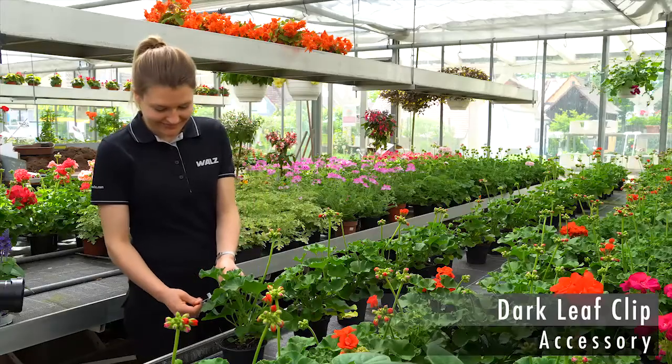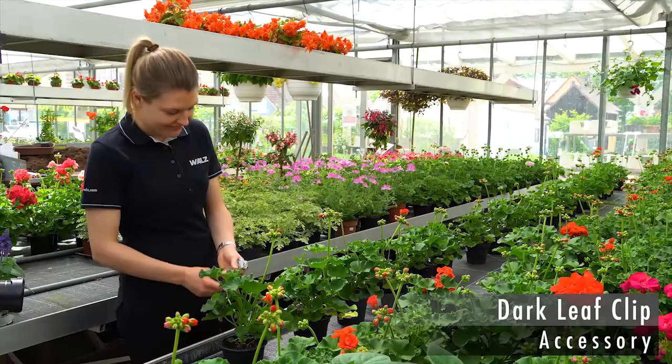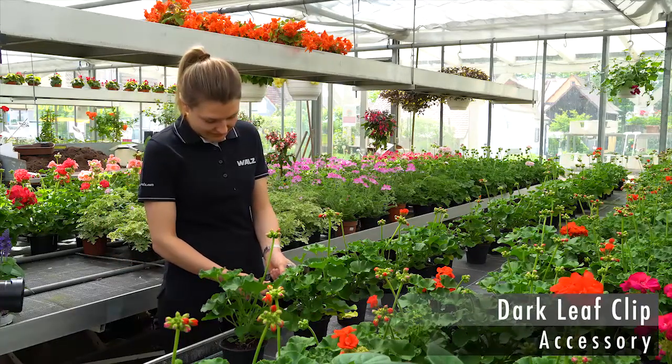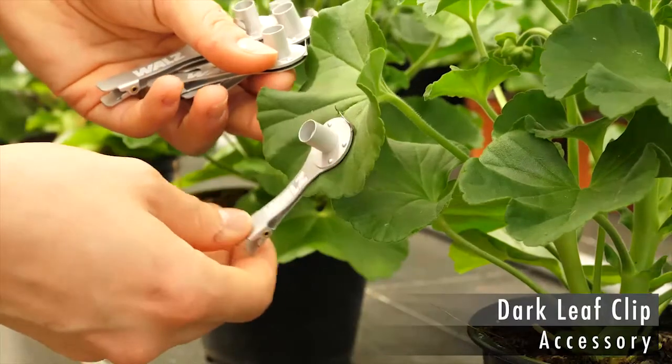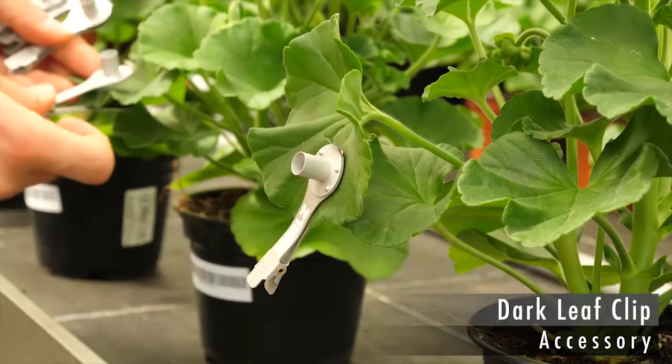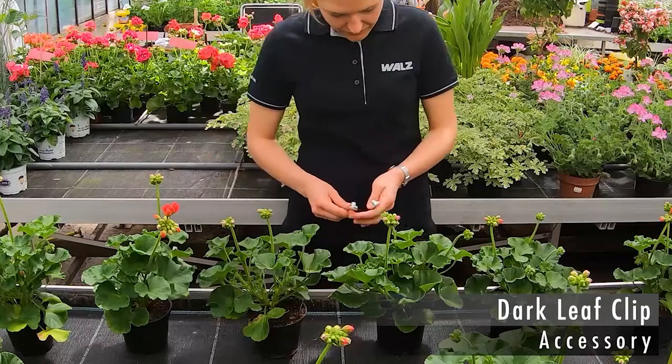To prepare the measurements, Sabrina positions one dark leaf clip on each plant. Preparing a number of plants in advance greatly increases the sample throughput within the measuring stage.